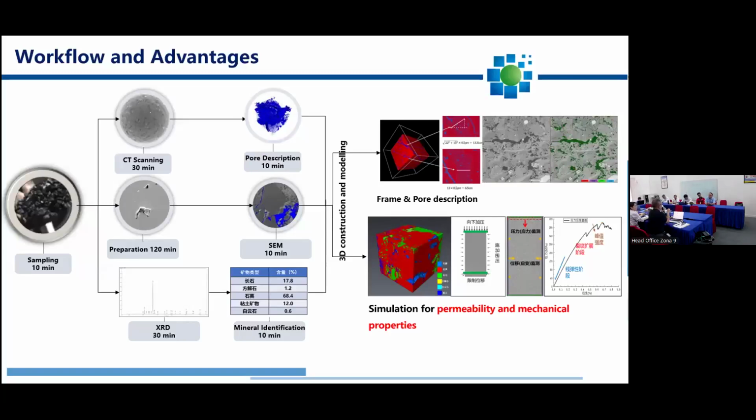The second thing you mentioned is that the cuttings will somehow be contaminated by mud, oil-based mud or water-based mud. For our process, we don't need to wash or dry the cuttings, because different types of fluid have no effect on CT technology. So the contamination or the mud will have no impact on our technology.